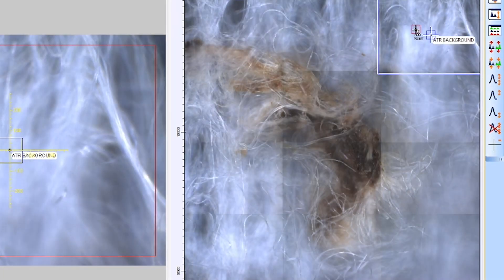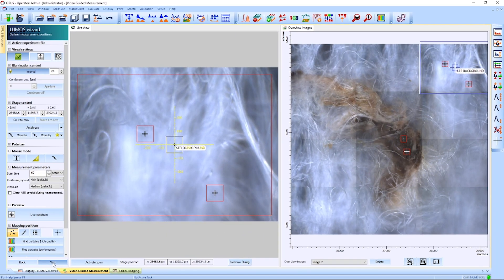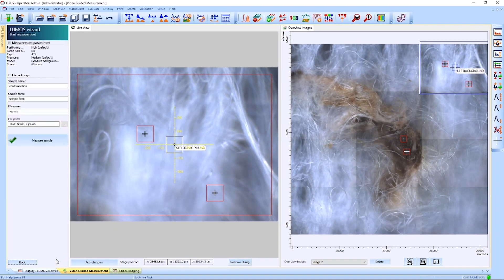From there, we can select several points on the overview image we want to analyze, from both clean and contaminated regions. Once that's done, we can name our sample and we'll finally start the automated analysis.